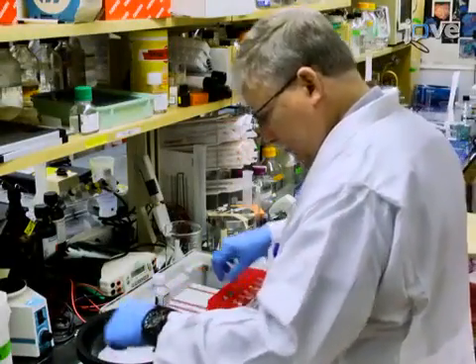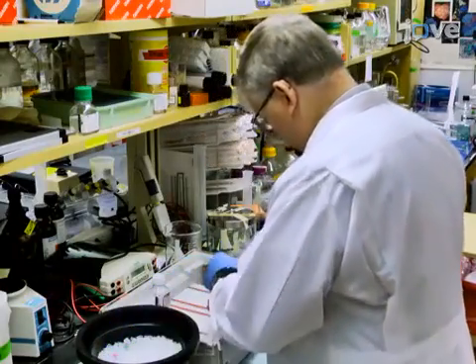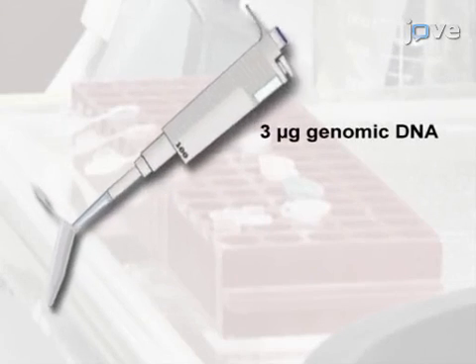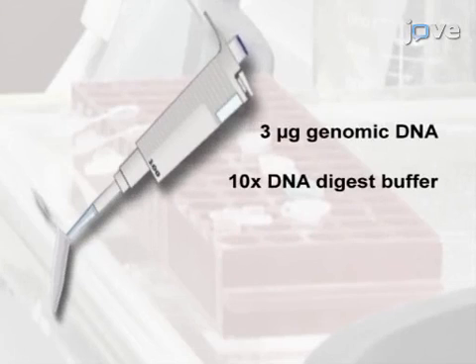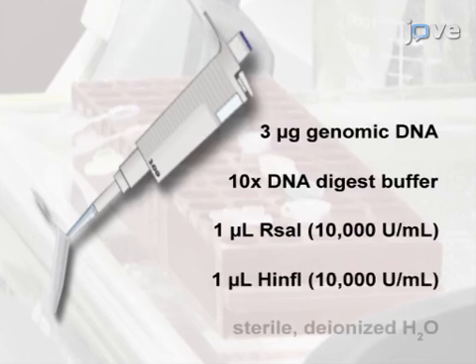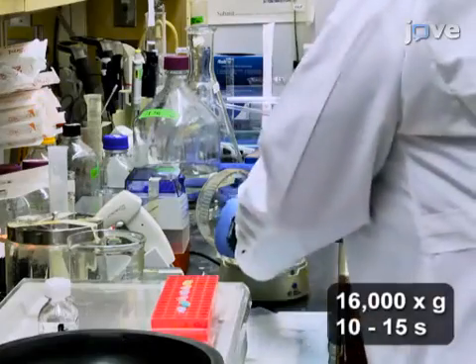The genomic DNA samples to be analyzed were extracted from cells using a commercial DNA extraction kit as described in the text protocol. Perform the digestion of the genomic DNA in a final volume of 20 to 40 microliters. Combine the following in each microcentrifuge tube: 3 micrograms of genomic DNA, 10x DNA digest buffer, 1 microliter of RSA1 restriction enzyme, 1 microliter of HIN F1 restriction enzyme, and sterile deionized water to the final volume.